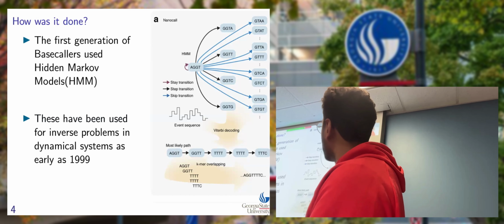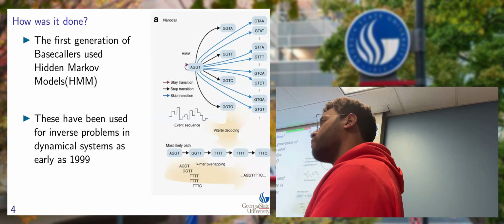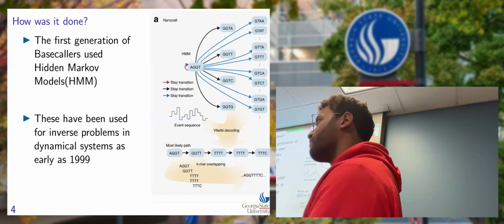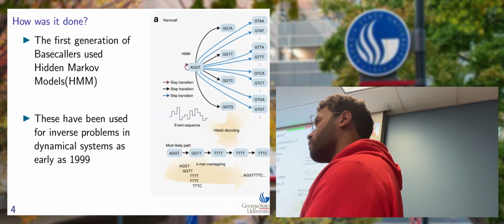Now, if we make it very small, 2 bits for the weight can go from 0 to 3, 4 values. If I go with 3 bits, I go to 8. Yeah, 4 bits and so on can grow. But this comes with a computational cost. Yeah, exactly. These weights need to be held somewhere for storage and processing, which takes more instructions, longer numbers.